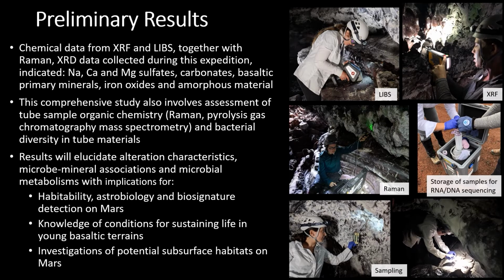The comprehensive study that we're undertaking of these lava tube materials also has involved the assessment of organic chemistry of lava tube materials through Raman spectroscopy and also pyrolysis gas chromatography mass spectrometry. And in addition, we are also studying the bacterial diversity in the lava tube materials through RNA DNA sequencing. And so I won't go over the details of those results here, but all that is being worked on too.